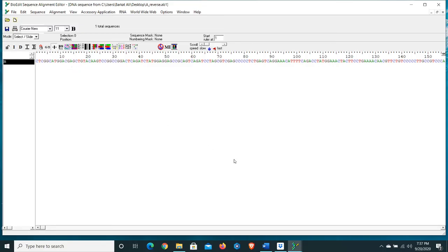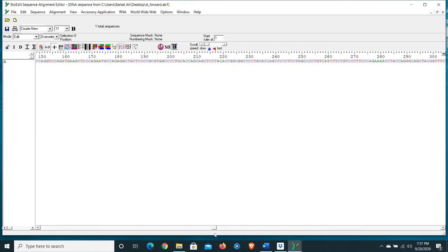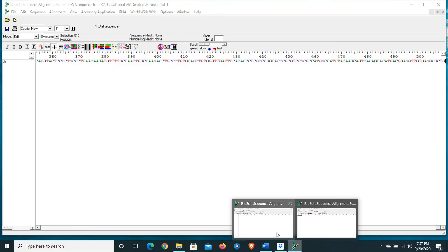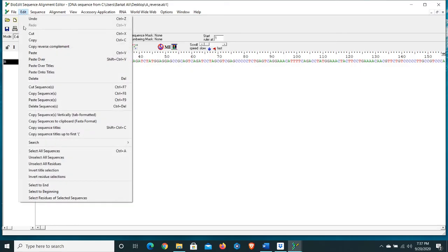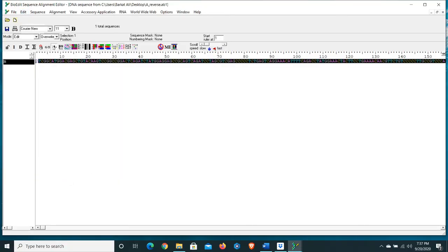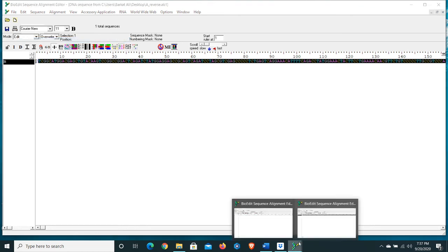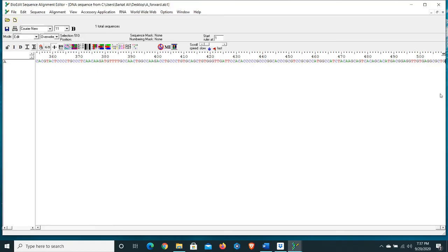After that, go to the forward sequence. Here we have the forward sequence — go to the end of the sequence and click after the final base. Then go to the reverse sequence, change the mode to Edit, select the beginning of the sequence, go to Edit, select 'Select to End', and copy it. Go back to the forward sequence and press Ctrl+V to paste it here. We have pasted the reverse complement — now we have combined both forward and reverse sequences using a few simple steps.